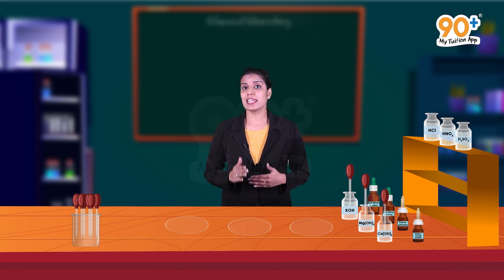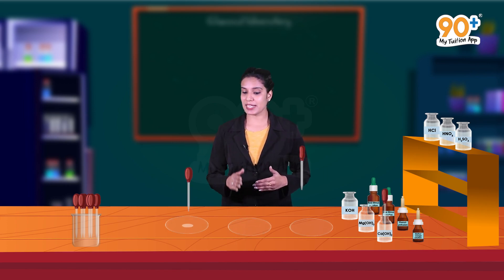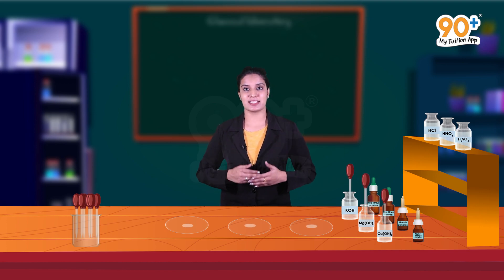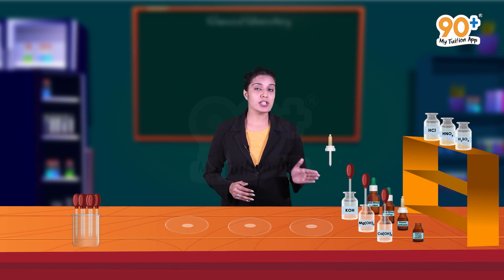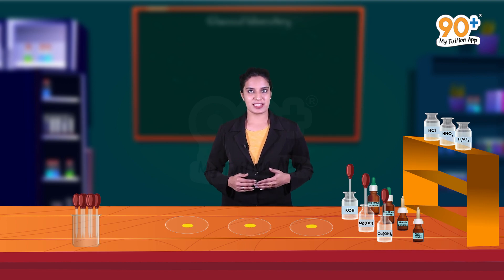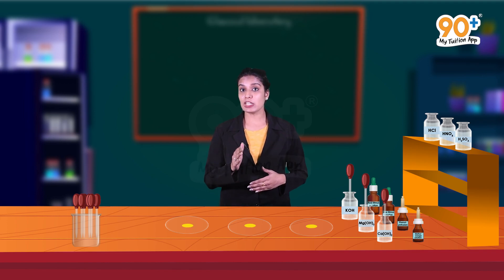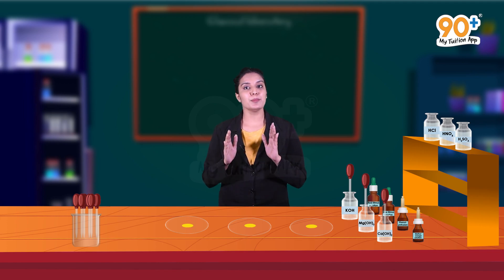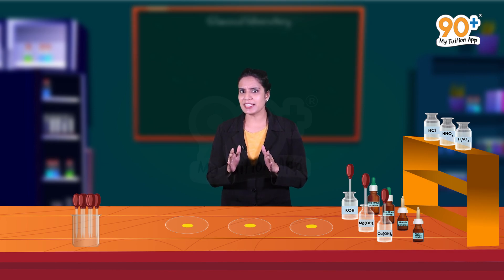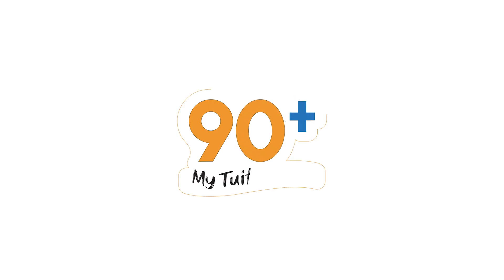Now let's take one drop of potassium hydroxide, magnesium hydroxide, and calcium hydroxide in three watch glasses, and add one drop of methyl orange to each of them. See, the solution turns yellow color. Methyl orange gives such a color change only if it meets something basic in nature. Hence, it is very clear that all these items are bases.